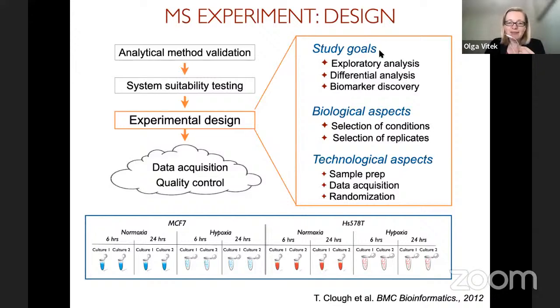If we had all day, I would tell you more about the differences between these methods, but the long story short is that these different goals require different statistical and machine learning techniques. And so MSstats focuses specifically on differential analysis. If we find proteins which change in abundance between conditions, these proteins are not necessarily biomarkers, for example. And that's really important to remember.